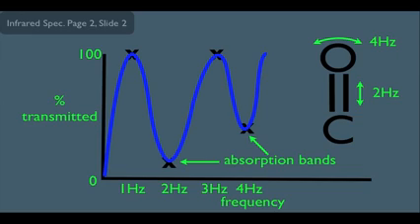For instance, it's safe to assume that, let's say, if the carbon were singly bonded to the oxygen, remember single bonds are longer than double bonds. So you can think of that single bond as being a different type of quote-unquote spring than the double bond. Which means if your molecule had a C singly bonded to an oxygen, that bond would stretch and wag at different frequencies than the C double bonded to the O, and would therefore have its own unique absorption bands. So notice what the IR helps us figure out. It simply helps us determine what functional groups might be present in a molecule.